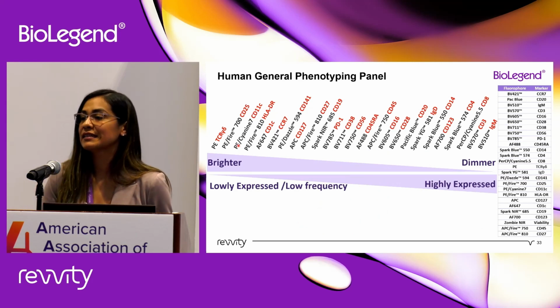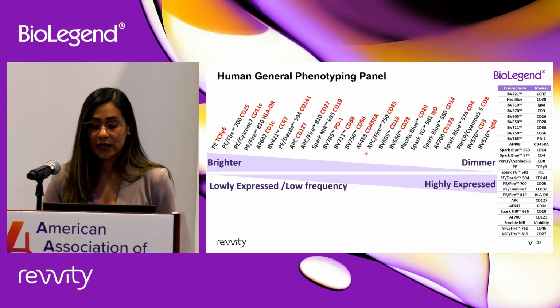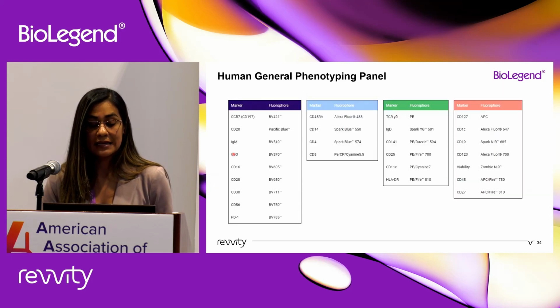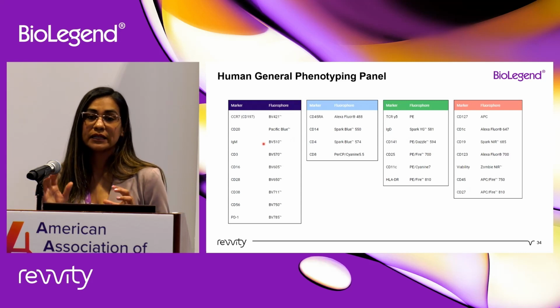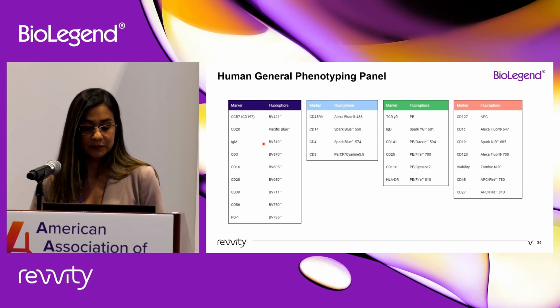So at the end, this leaves us with this panel. I have included all the markers that we selected today. And this gives us a very well-balanced panel that has distributed the markers based on the similarity index, the gating strategy, and also to minimize the spreading between them.